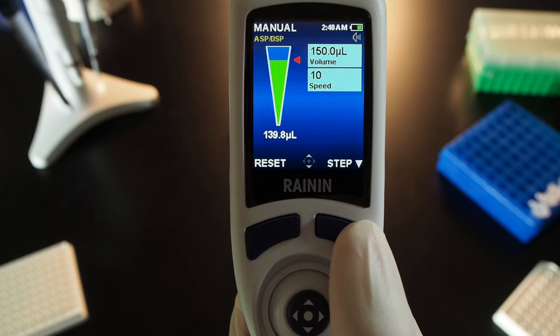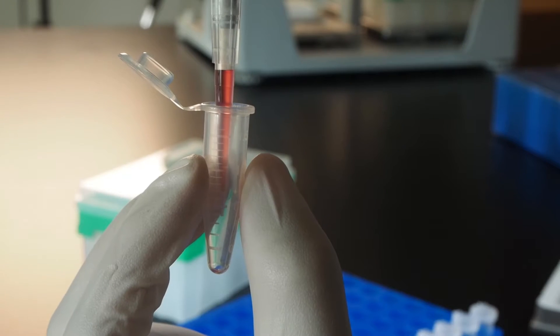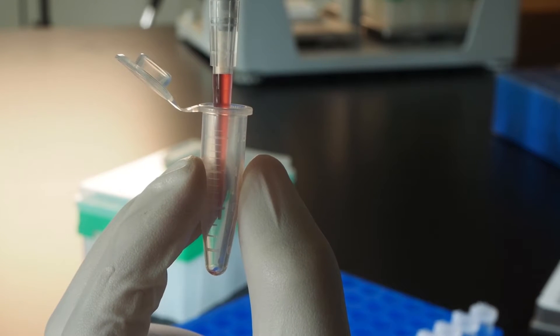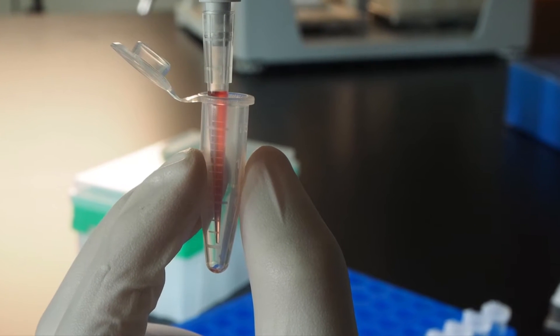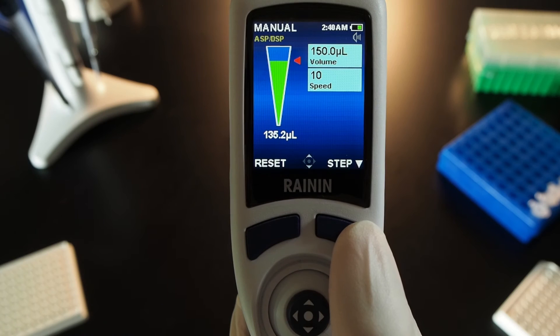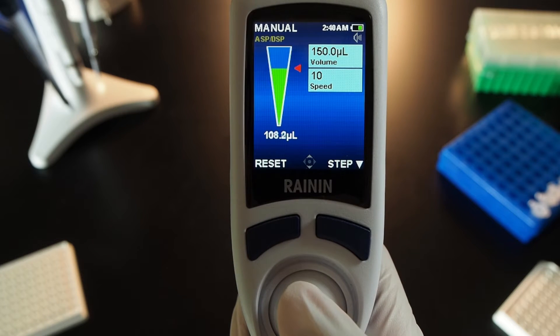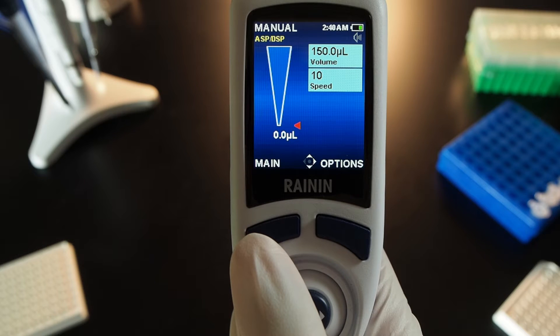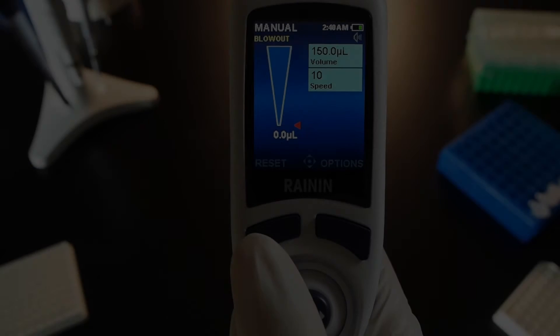Press the button on the right to step down in 2-tenths increments. Watch the tip closely and continue stepping down until the air is gone, with liquid poised to exit the opening. Note the volume of your sample. Then move the joystick down to clear the pipette. When the tip is empty, press reset.